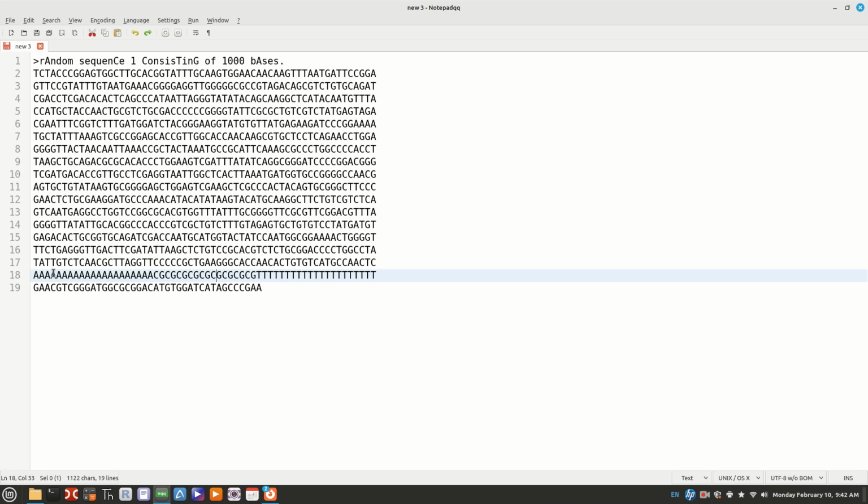This is a perfect one. You'll never see this. But it's going to stand out because it's very close. I'm pretty sure I got close to the same number of T's and A's. That was the idea. It probably still looks like there are a few more A's, but it's close. So this is going to show us what a terminator looks like.